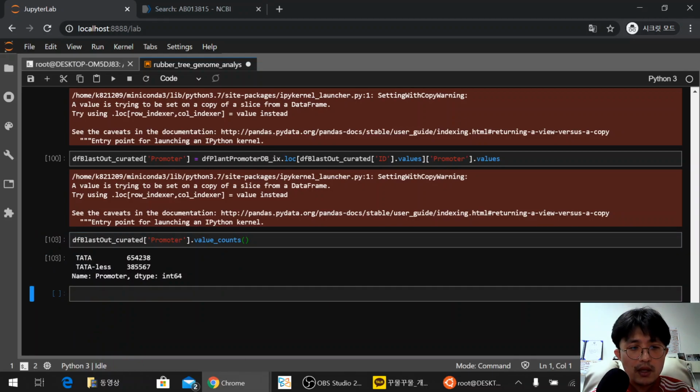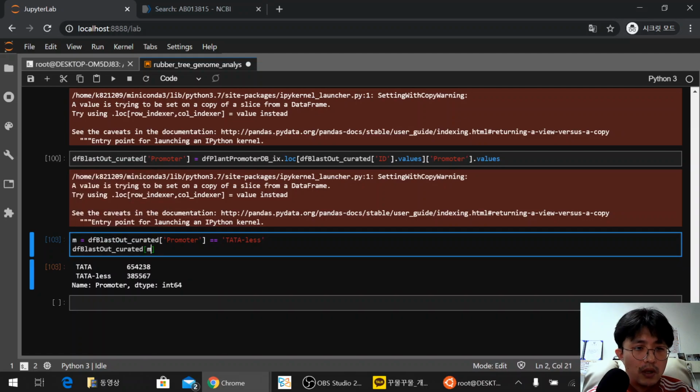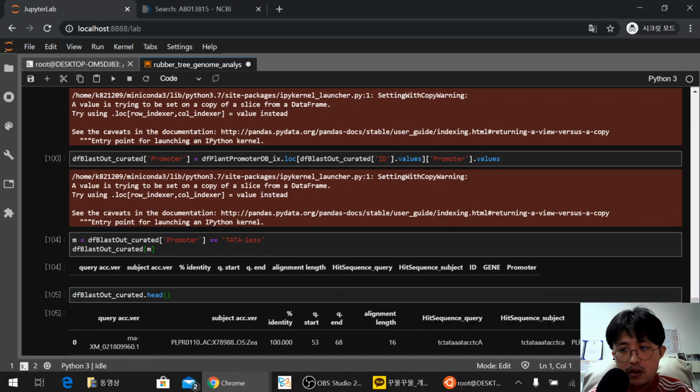Right? So only TATA or TATA-less. So maybe TATA. If you select only TATA-less, BLAST curated masked. Why?